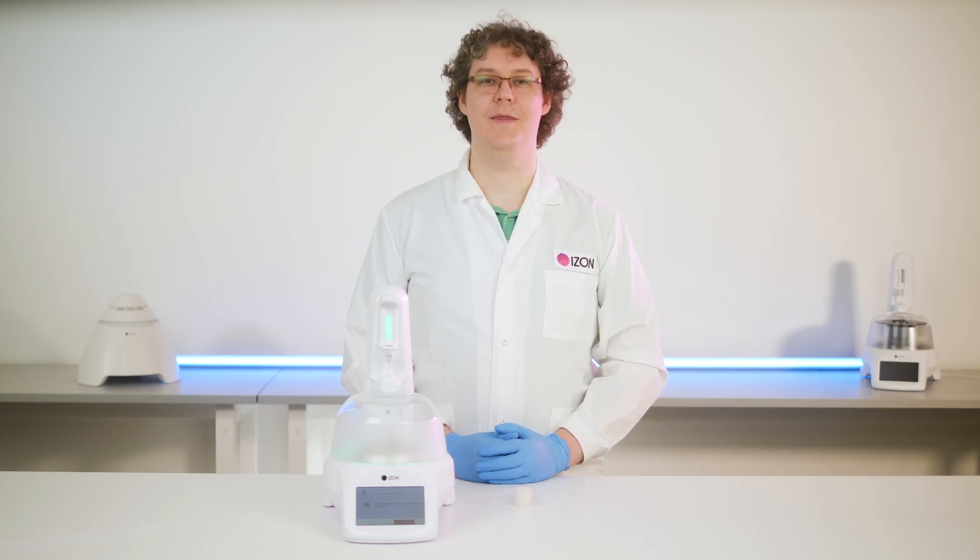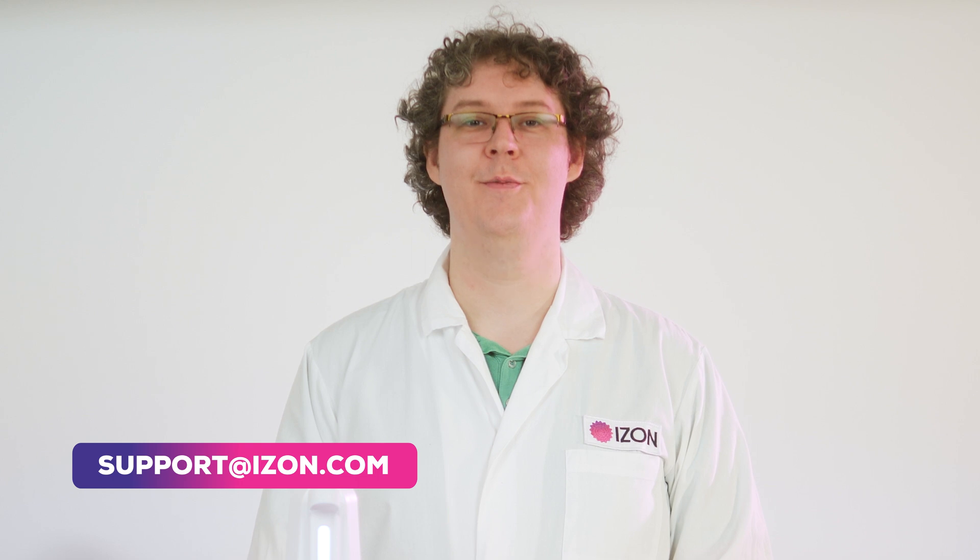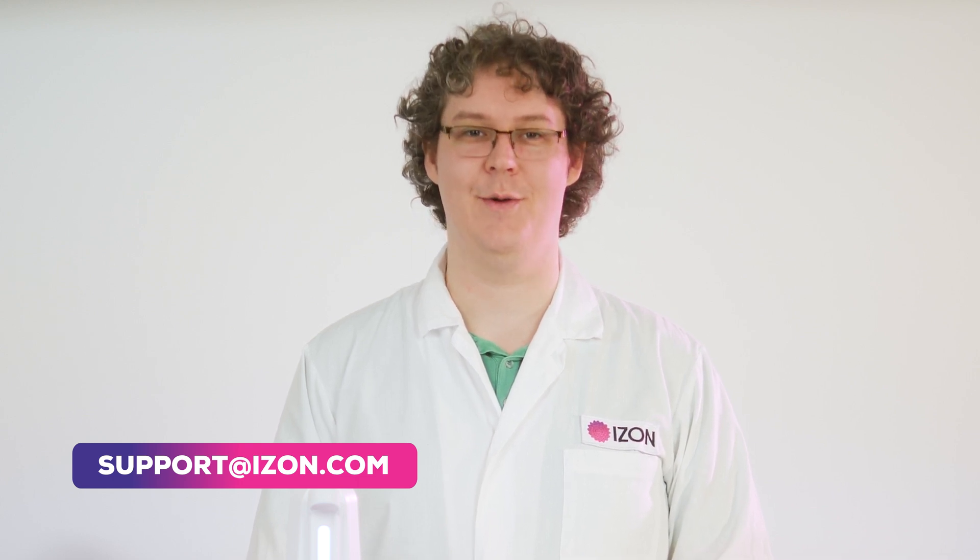Once both the carousel position and the scale have been calibrated, your AFC is ready to use. Please contact us at support@izon.com for more information or if you have any questions.